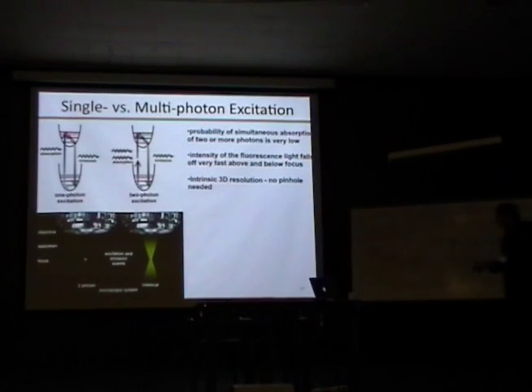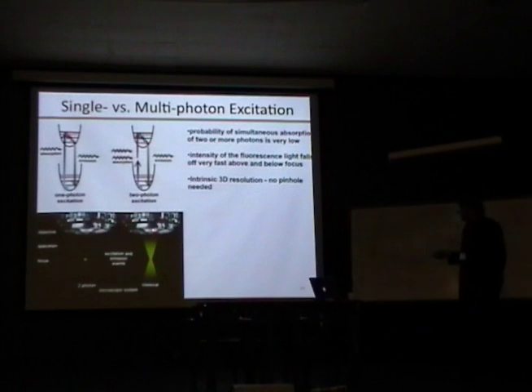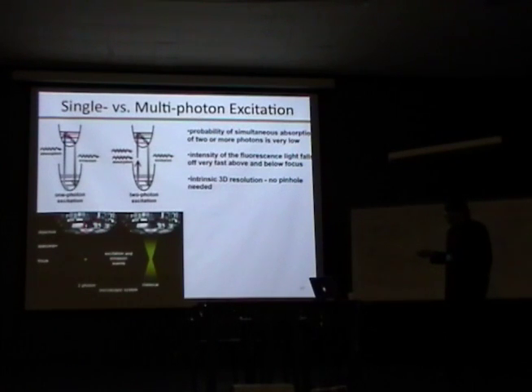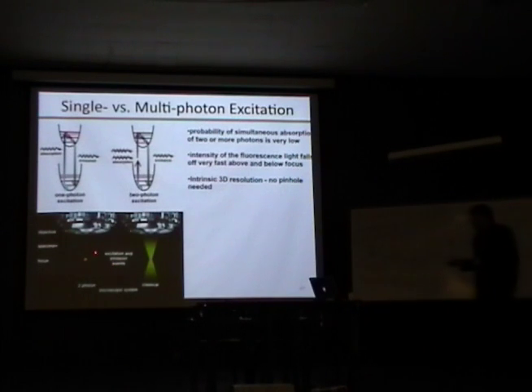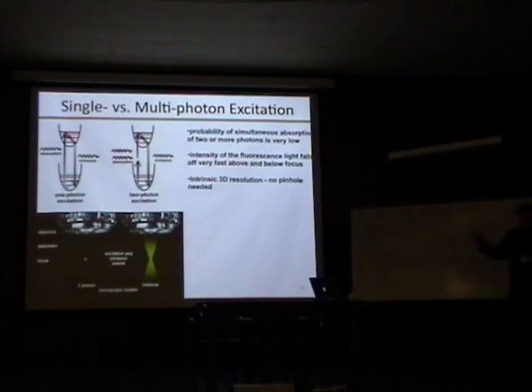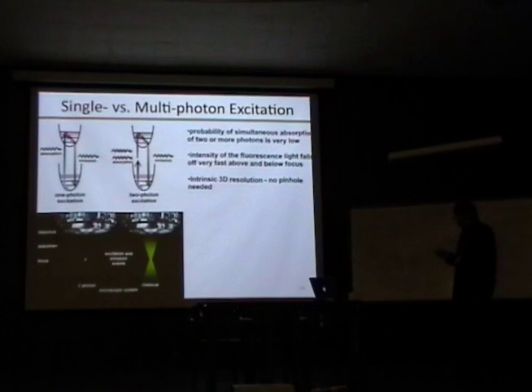So the cartoon in here again gives us a comparison of how the fluorescence emission is different in a regular confocal microscopy system and also in a two-photon excitation fluorescence microscopy system. So in the case of the two-photon absorption excitation process, we can see that the fluorescence is effectively excited only in the vicinity of the focal point of the sample, while in the case of linear single photon absorption, there is a fairly strong excitation pretty far above and below the focal plane of the sample.